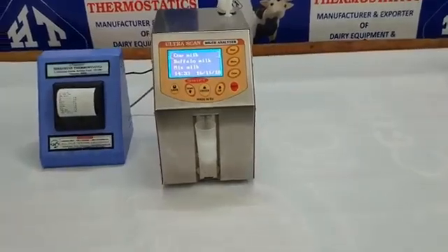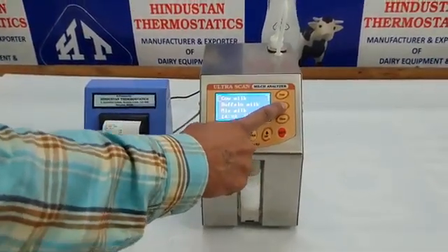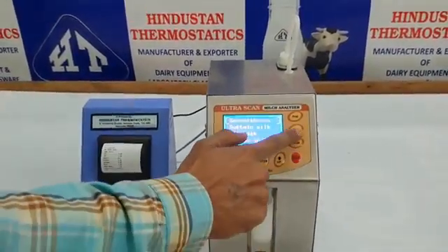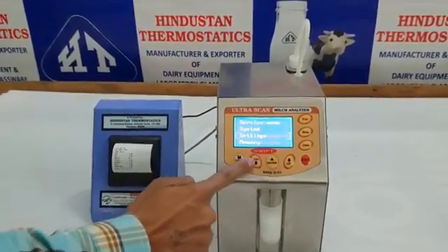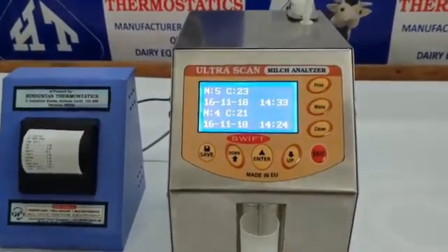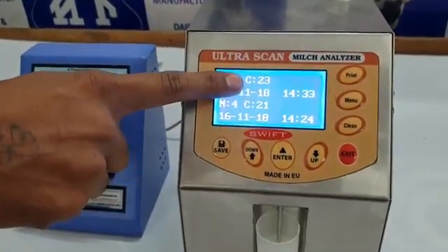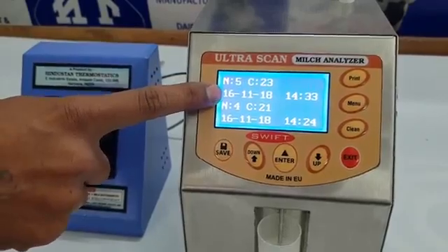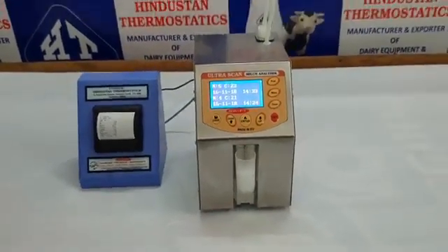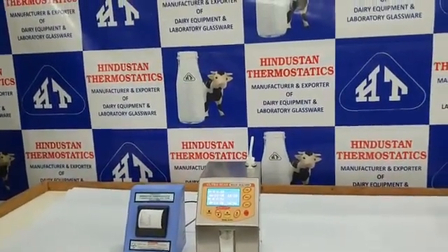The cleaning history can be viewed on the screen itself — a key feature since proper cleaning is critical for these analyzers. To check: click Menu, then Setting, scroll down to Cleaning, then View History. Here, N stands for the number of times the machine has been cleaned since usage, C stands for after how many samples the machine was cleaned, and below this you can check the date and time of each cleaning. This is the most important aspect of ultrasonic milk analyzer technology — the machine must be cleaned at the proper time and with the proper procedure.